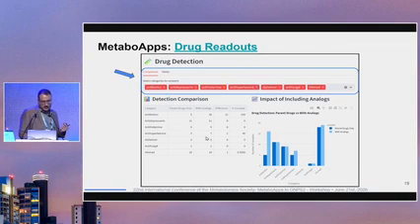And you also have the detection comparison, which is one of the things that is highlighted on this tool, and that we also show some applications of in the paper published, which is the idea of keeping track of whether the parent drugs are present in your samples, or the analogs or the metabolites.